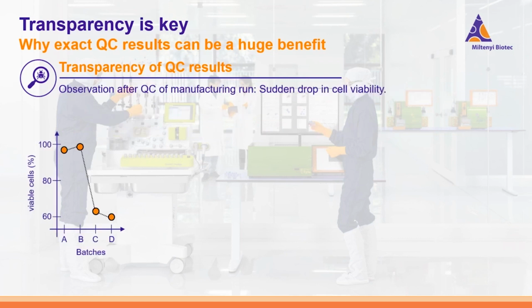So let us assume you're running a QC of your latest batch of your cell therapy, and you have produced and tested 4 batches, A to D, and one of the parameters you have checked is the number of viable cells. And what you can see here is batch A and B, everything looks fine. You have nearly 100% viable cells, but then for batch C and D, the number of viable cells dropped to like 60%.